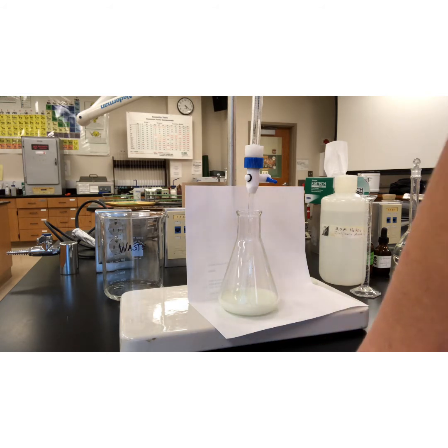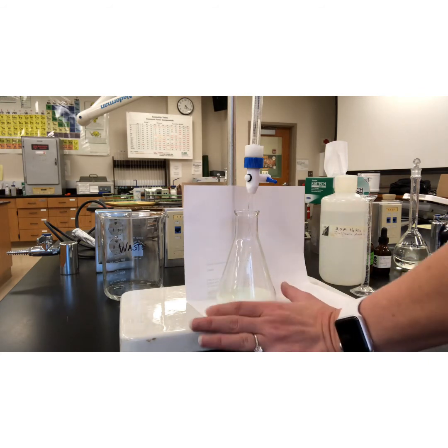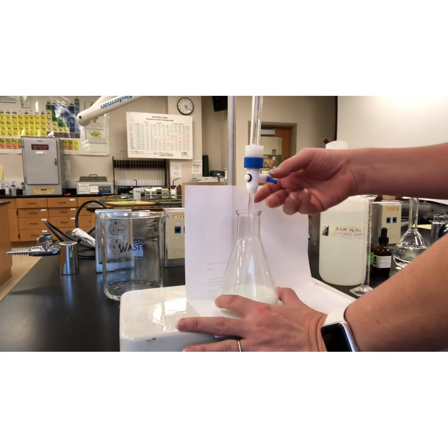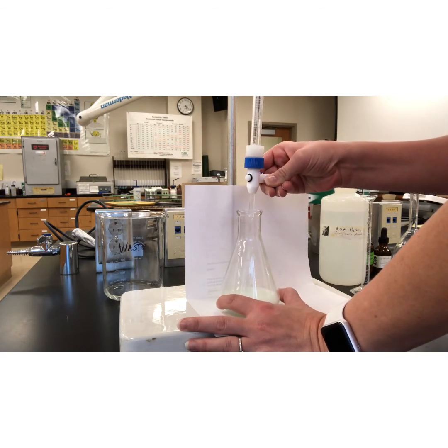So let's go ahead and see that we've got 19.01 milliliters. I'm just going to note that for now. I'll write it down so I don't forget it. So 19.01 milliliters. This may or may not be our endpoint, but just in case it is, we're going to write it down because we can't take it away, right? We can always add more, but we can't take it out. So I'll add a few more drops.